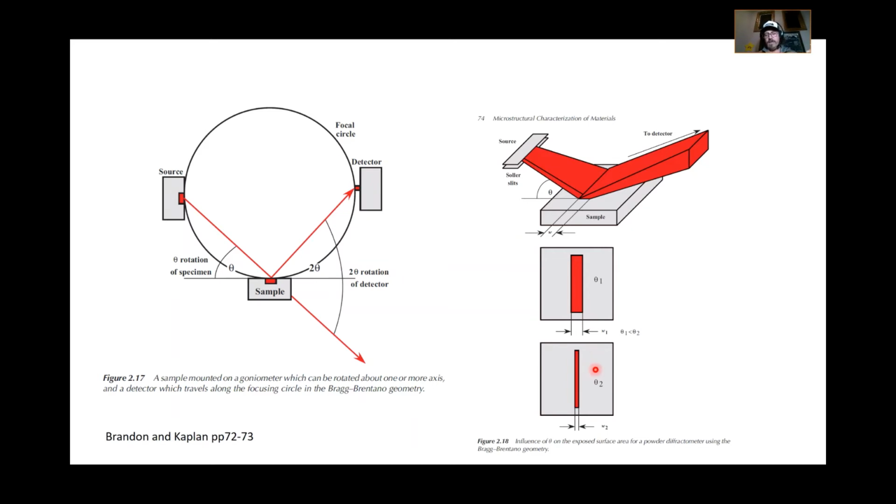Smaller slit, you get a smaller signal, but you also get less noise. And sometimes you can obscure peaks by having wider slits. So don't forget that. Remember what I'm saying. With wider slits, you get more signal, but you can actually obscure peaks, so multiple peaks may appear as one. You can resolve more peaks with smaller slits, but your signal is less intense as well. Anyway, bear that in mind. Commit this to memory, and you'll be fine.